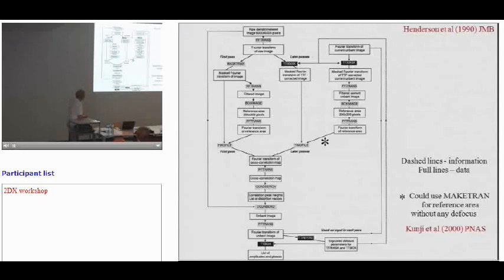And then if it's a tilted image, that's what these black box programs, we had TTMASK. What that did was to correct either the raw image or the unbent image so that the amplitudes and phases of the Fourier components, instead of varying as you go across the direction of increasing height in the image, had been corrected to be like they would be in an in-focus image, if you like, that hadn't been affected by the contrast transfer function.